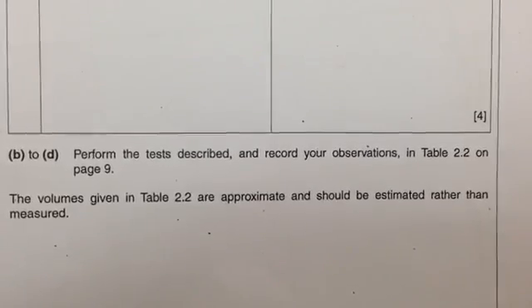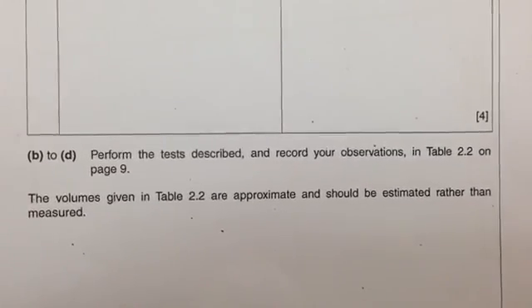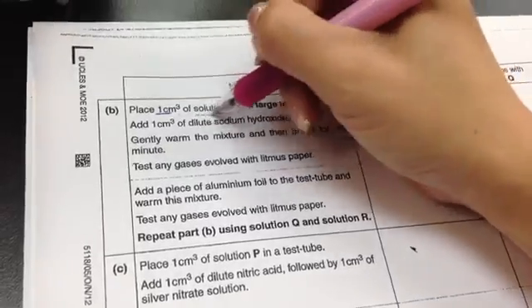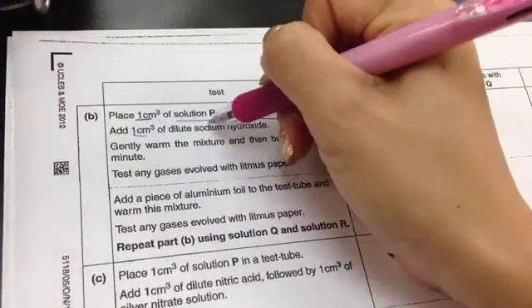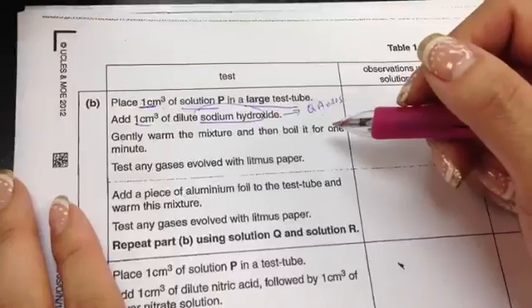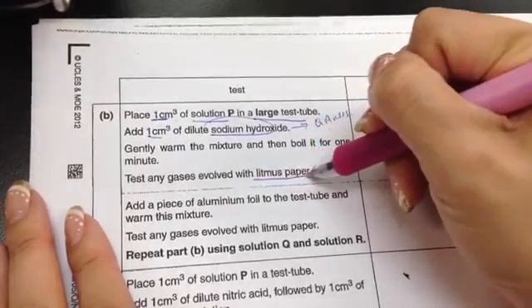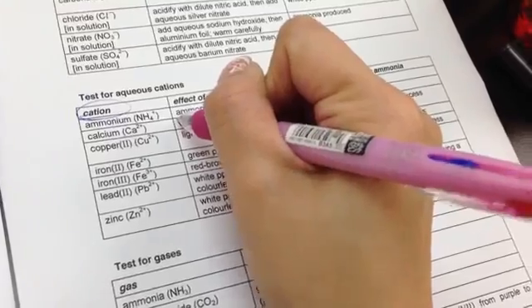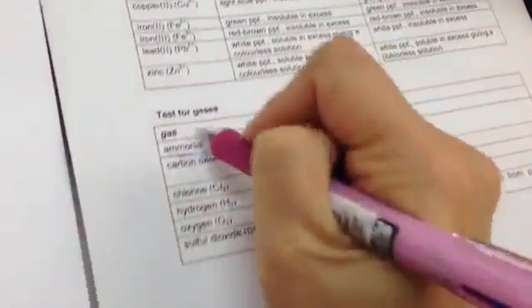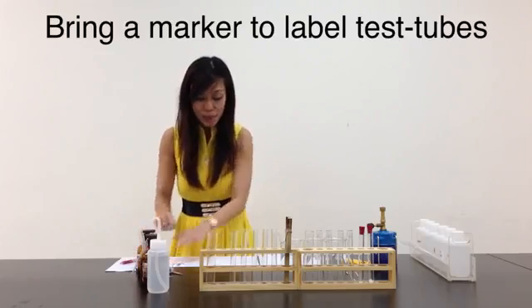It goes on from B to D: perform the tests described and record your observations in table 2.2 on page 9. The volumes given in table 2.2 are approximate and should be estimated rather than measured. Part B says: place 1 cm³ of solution P in a large test tube, then place 1 cm³ of dilute sodium hydroxide. Sodium hydroxide — we have to refer to the QA notes. The QA notes say that when you add sodium hydroxide, you are testing for cations. It says to gently warm the mixture, then boil it for 1 minute and test for any gases evolved with litmus paper. According to the cations table, the only one that will give out gas is ammonia. To test for ammonia gas, you use damp red litmus paper — it should turn blue.